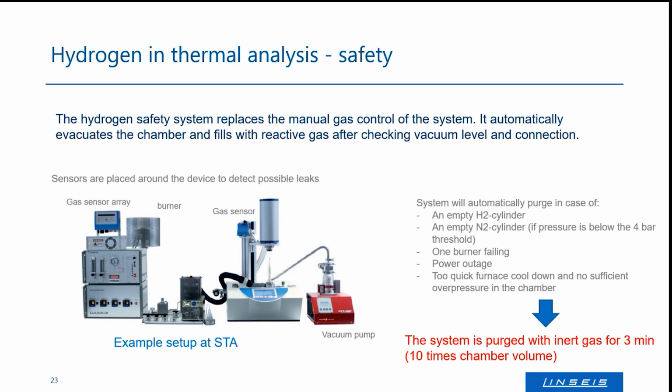And I would strongly recommend using a configuration like this if you want to do such experiments, because once there's a leakage and there is hydrogen release and you have a hot furnace in the room or in the instrument, nobody should be needed to run to the instrument and push any kind of button manually, because then he's standing right in front of it, and that could end very poorly for the person who has to go there. So therefore, that's what we developed, and that's where Linseis is leading in customization of these kinds of instruments and applications.